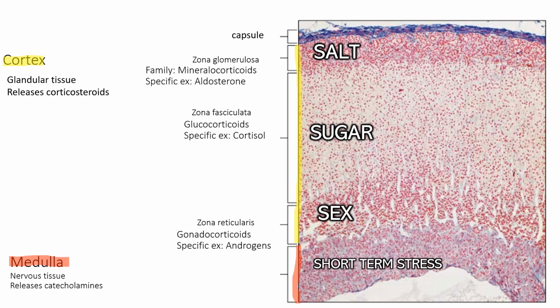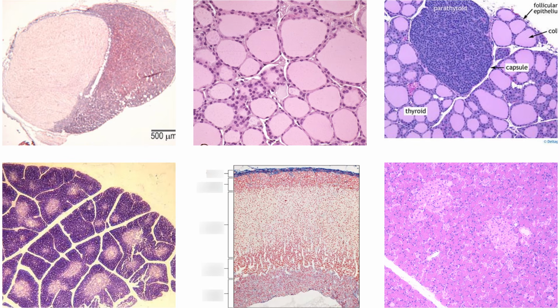All right, so I believe that's the end of what everything looks like and the specific parts. So now I just want to give you a second to look at them all side by side, try to recall what they are, and then we'll look at them individually and see if you can at least identify what organ it is. 10 seconds from now, answers are coming up.